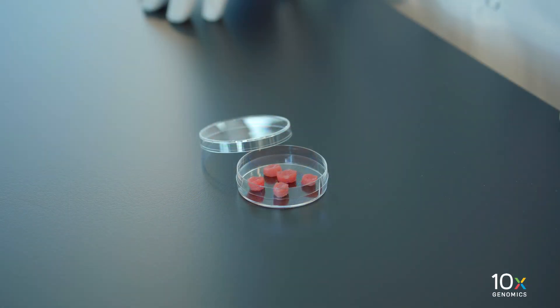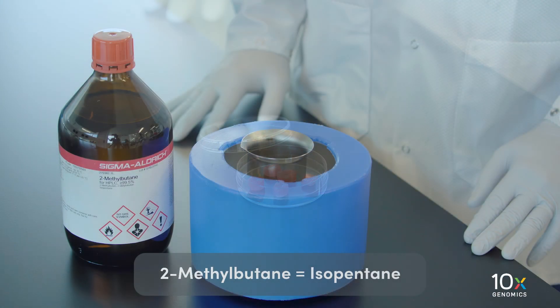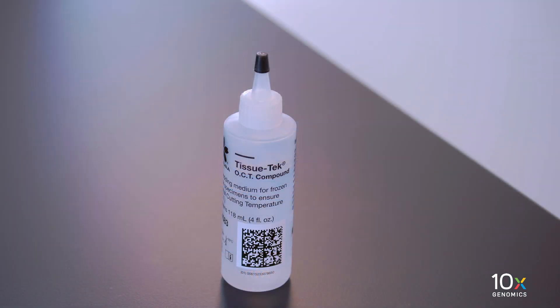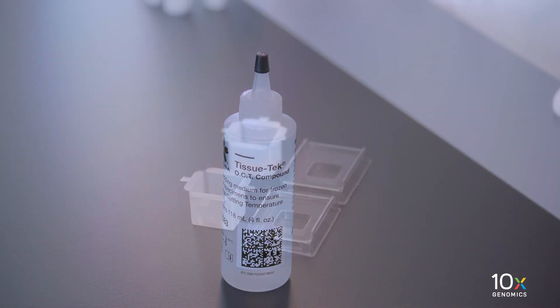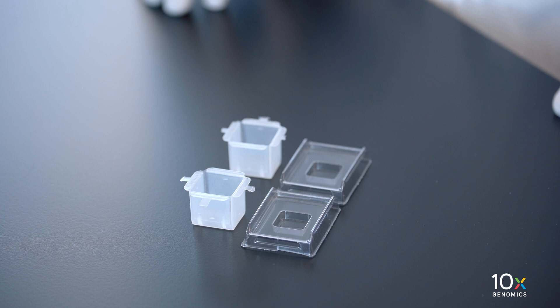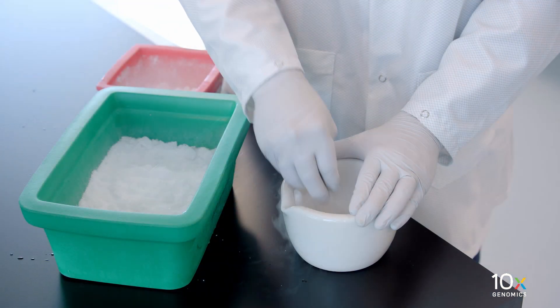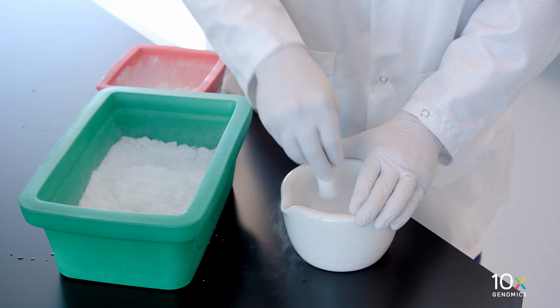We are preparing to simultaneously freeze and OCT embed fresh tissue. We will need: the fresh tissue, materials to make an isopentane and liquid nitrogen bath, OCT at room temperature, a cryomold for embedding, forceps and spatula, and powdered dry ice made with a mortar and pestle.